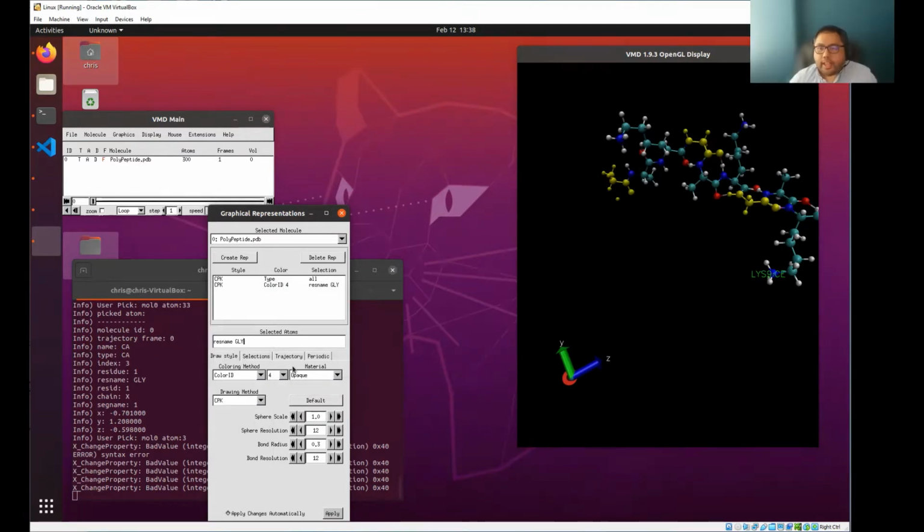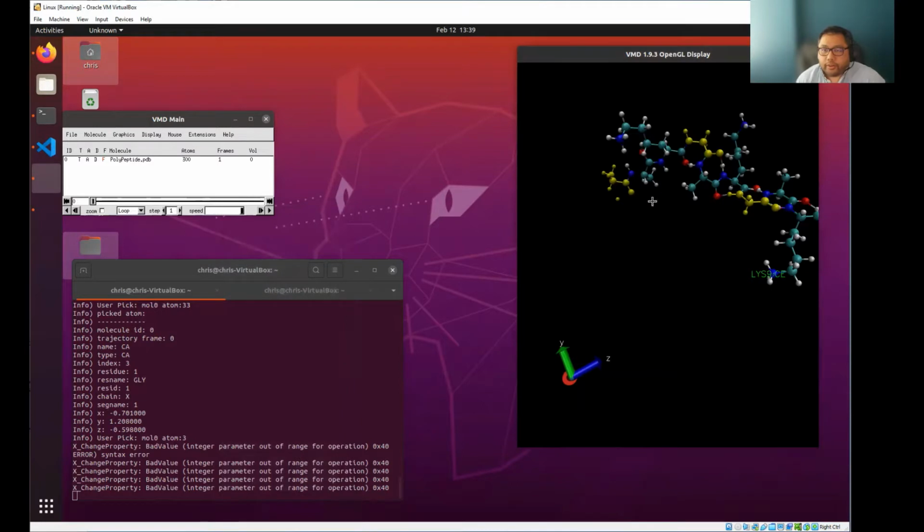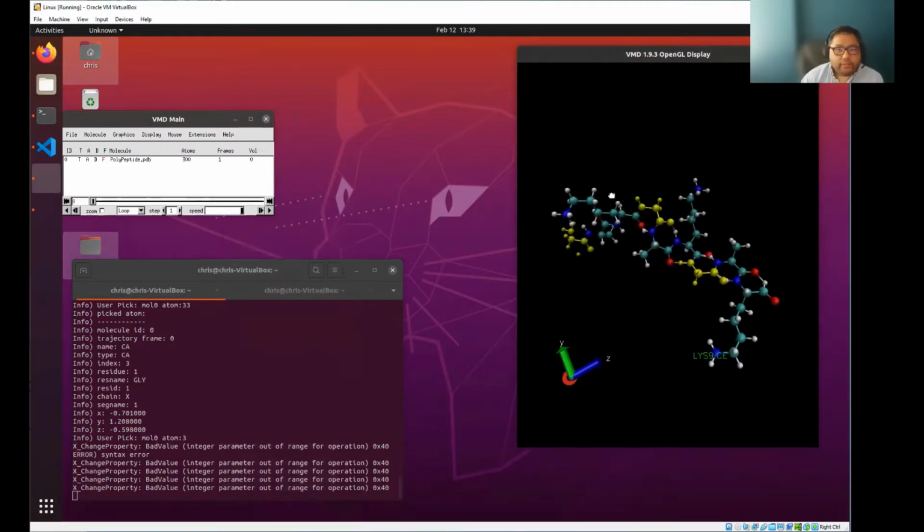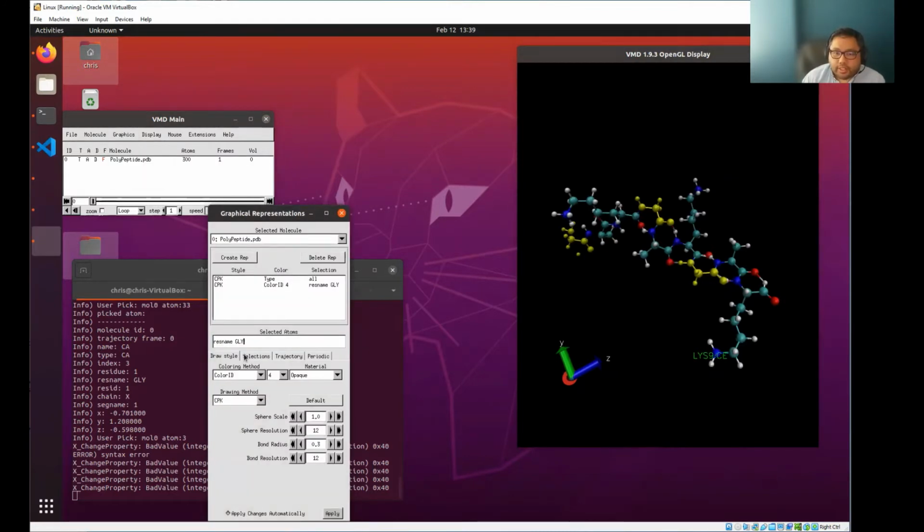You'll hear me probably say during this workshop how this program is kind of an art as much as it is a scientific endeavor. You're only limited by your imagination, really. They give you so many tools that I'm constantly learning as I go, every day when I play around with this program. So if you want to start learning this, just literally throw yourself into it and start clicking things, scrolling your mouse around, choosing different options, and you'll slowly get the hang of it and learn all these little tricks and tips along the way, more so than I could ever go through in the next hour and a half.